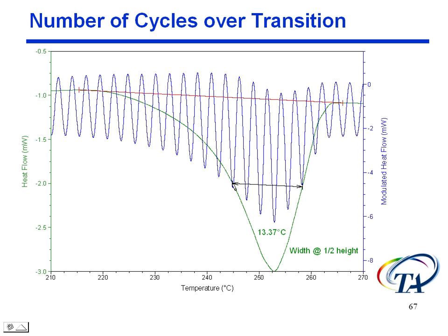So here's where I started. So here's 1, 2, 3, 4. Basically, I've got 5 cycles there, right? So I said 4 to 5. I've got 5. I'm in good shape here to deconvolute this melt peak.